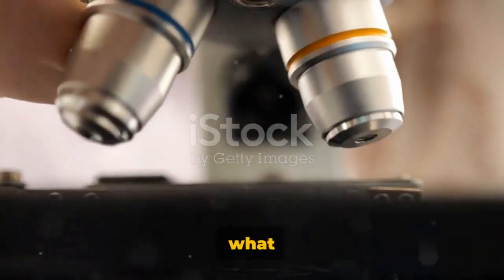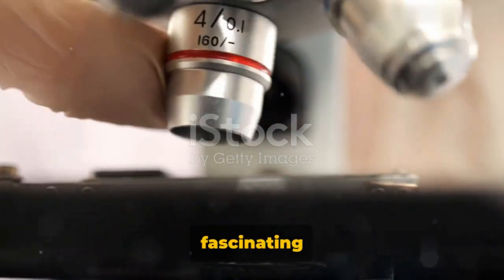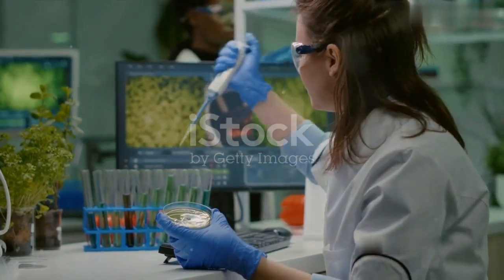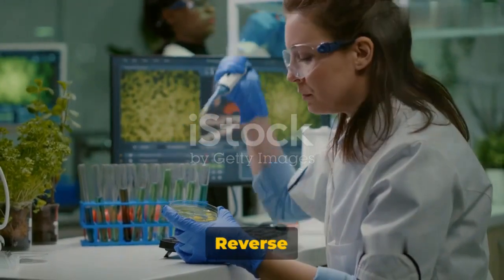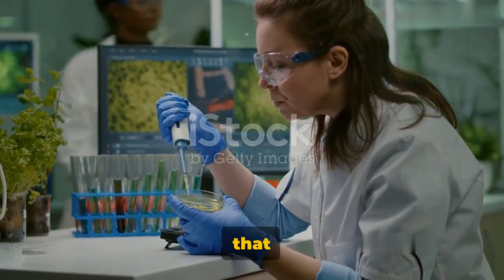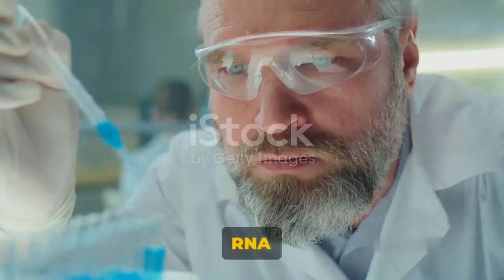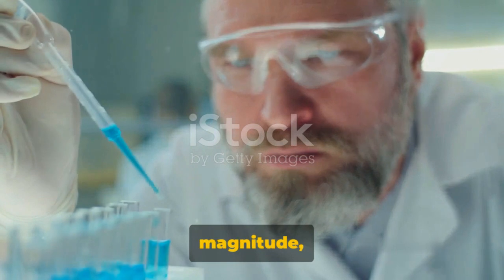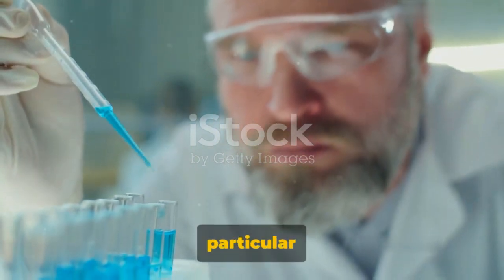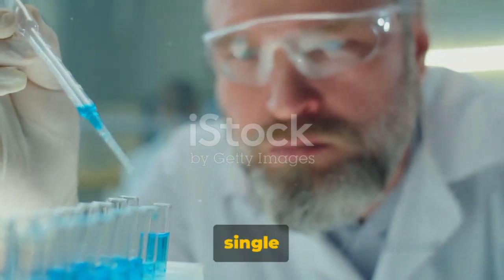Ever wondered what goes into the process of RT-PCR? Welcome to the fascinating world of molecular biology, where we decode the secrets of life. RT-PCR, or reverse transcription polymerase chain reaction, is a laboratory technique that amplifies a single or few copies of a piece of RNA across several orders of magnitude, generating thousands to millions of copies of a particular RNA sequence. It's like making a whole army from a single soldier.